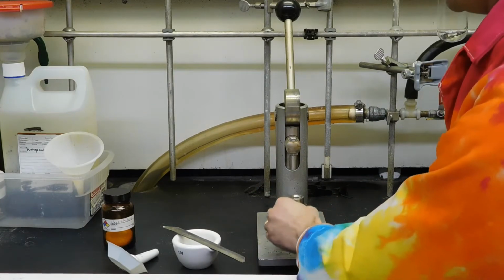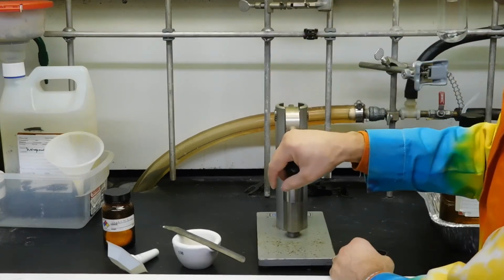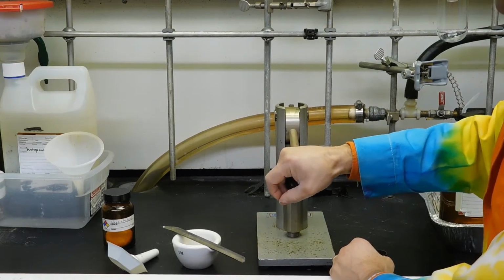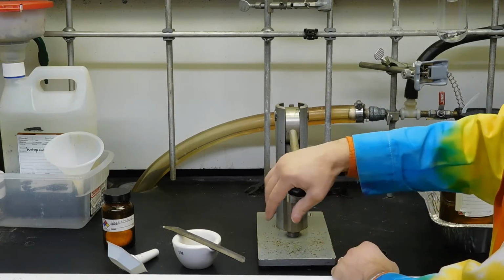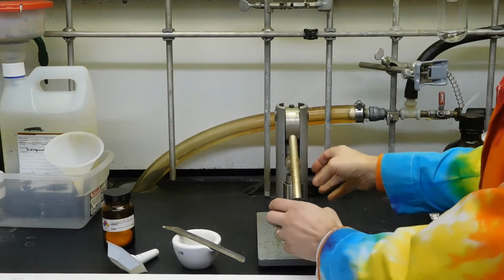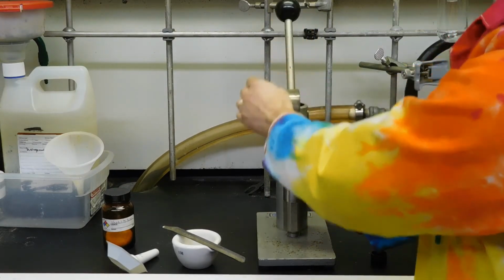So if things are adjusted properly, all you have to do is put this on here. You'll push this down gently, and you'll get to a point where it starts to be a little bit hard. We're starting to press on it, and you can see it's farther down than halfway, but not all the way down. And if you then press it until it hits there, you should have a pretty good pellet. And then you need to hold the thing down while you lift this up.